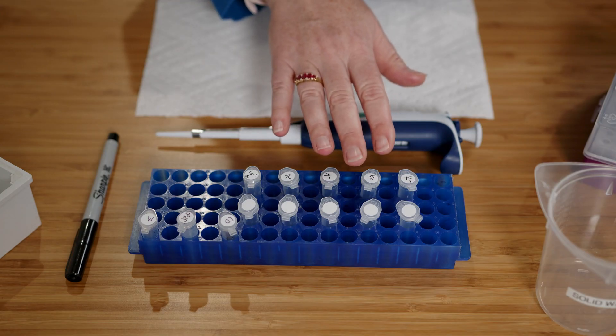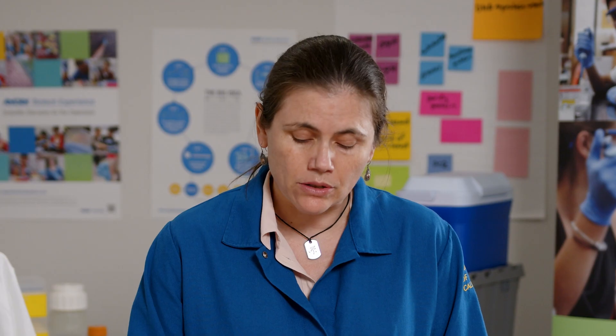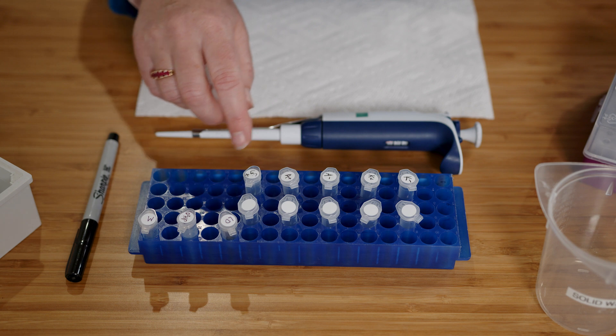These are the experimental and control samples from our digest in lab 2 and our ligation in lab 3. In order to get them ready for gel electrophoresis, I'll need to add some loading dye to each sample, because right now they're clear. I'll also add a little bit of water into each sample and then load each sample in a different well in the gel.